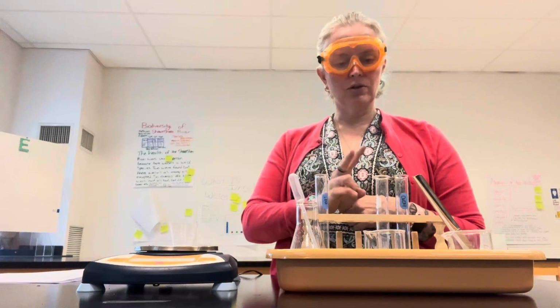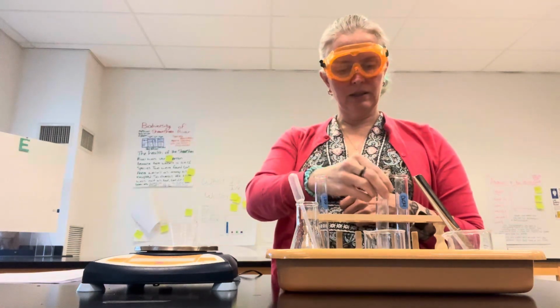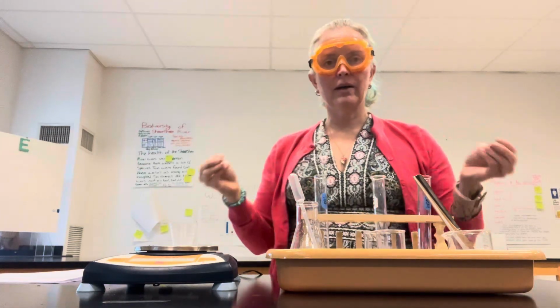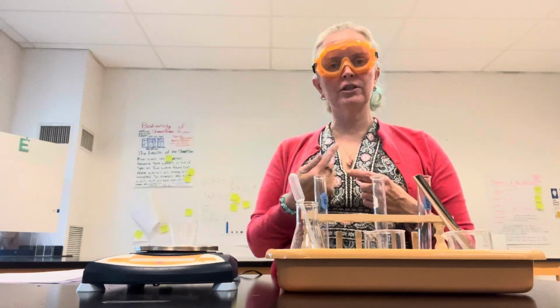The second person in your group will make a salt and water mixture. You just swirl it a little bit to see if it dissolves. And then the third person in your group will make a sand and salt mixture, and then think about how to separate those 2 substances from each other. You should work together and share ideas.